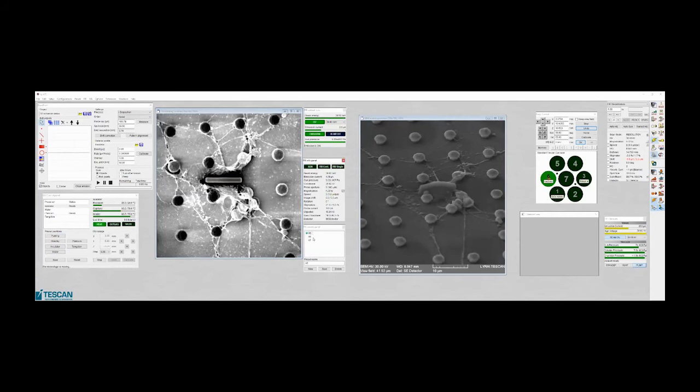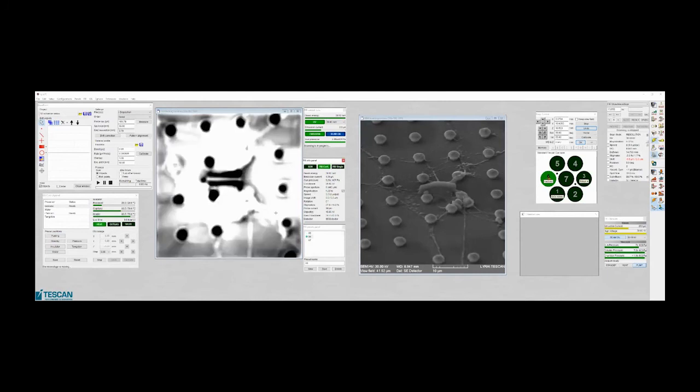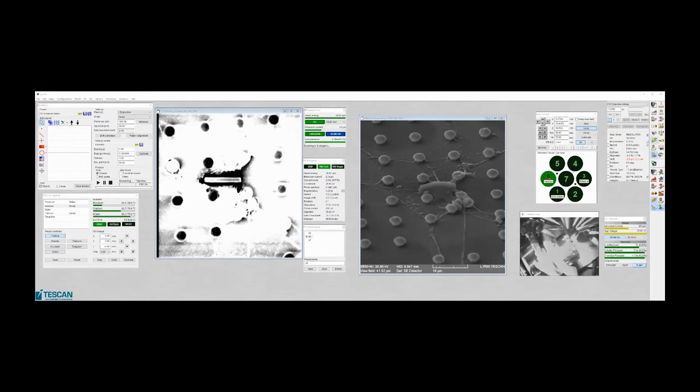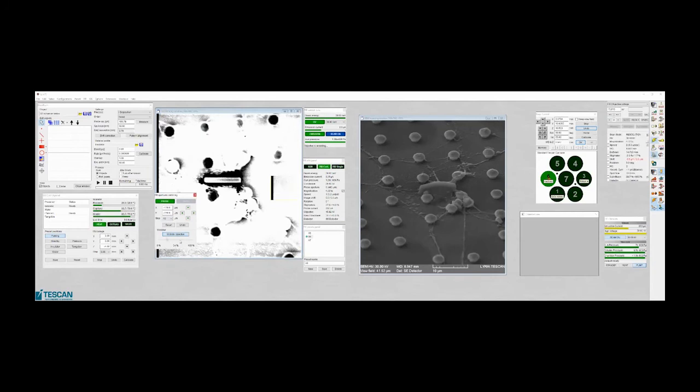I will move now to a bigger aperture. I just have to focus it again. Okay, it's moving there and back, so I have to align it. Okay, better. Maybe one more.